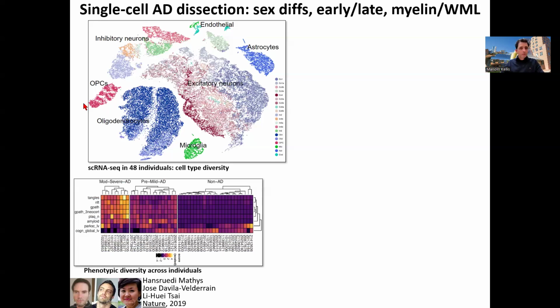In some cases, why would you call this whole thing oligodendrocyte progenitor cells and not a subset of those? In other cases, you have excitatory neurons that are shifting across a whole gradient of layer 1, 2, 3, 4, 5 of the cortex, which actually have distinct expression patterns, but they're more of a continuum than discrete cell types. So calling individual cell types from this data can sometimes be difficult. So this is the first step, basically clustering to identify what are the major drivers of variation. And that's a form of unsupervised learning, as we talked about in the last lecture.